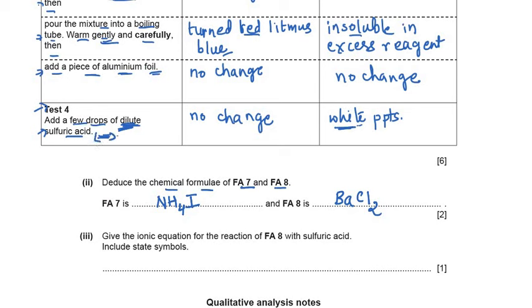Yes, we should know that the barium ions will produce white precipitates with sulfate ions. So here is the confirmation test that it was not calcium, it was barium which is giving the barium sulfate white precipitates here. So this was the confirmation test of barium. This also should be observed. If we have some confusion, there must be some other test given which will confirm our anion or cation. Okay, next there is one more sub question left for the same question.